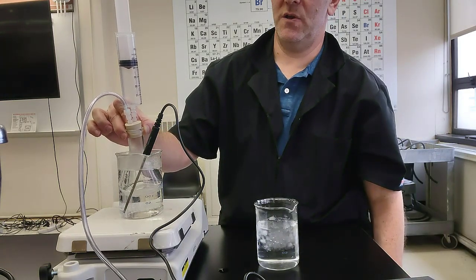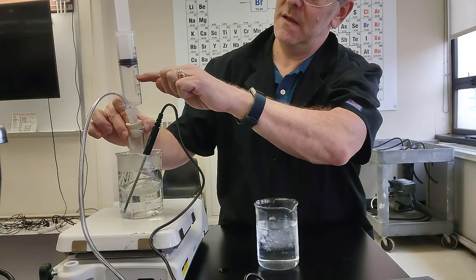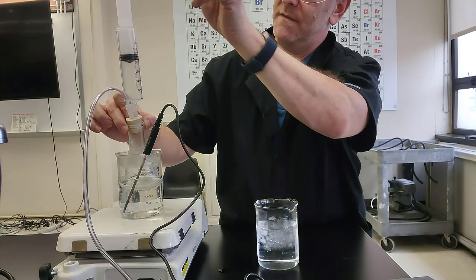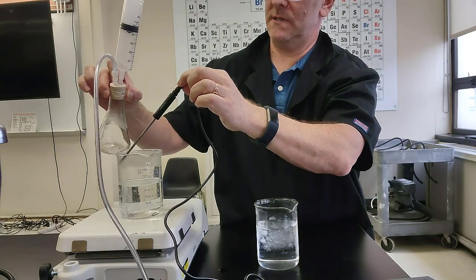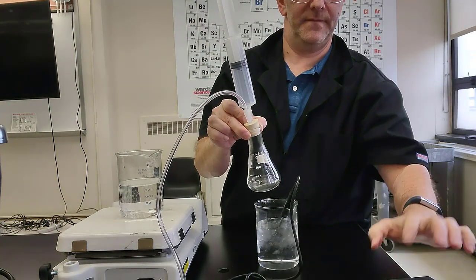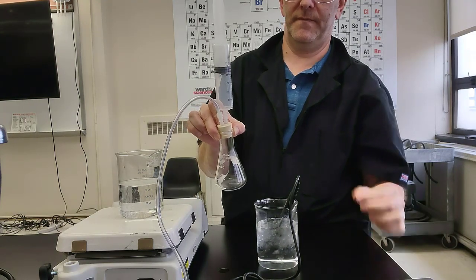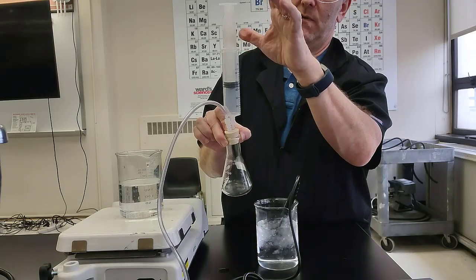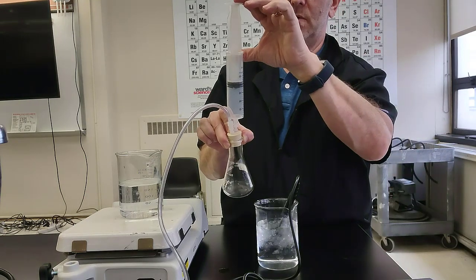Charles's law, volume versus temperature. High temperature, we went from 30 up to about 45 at around 100 degrees. Ice bath, close to 0 degrees. Let it cool a little bit more towards room temperature. Again, the syringe is moving relatively freely and it's bouncing back, staying pretty close to 1 atmosphere.